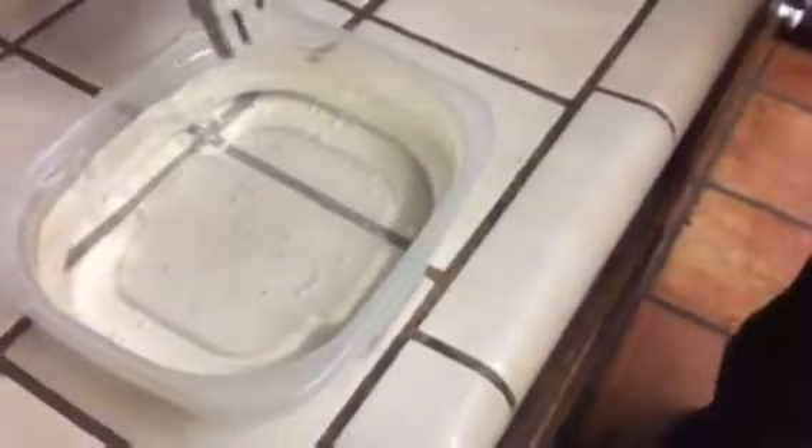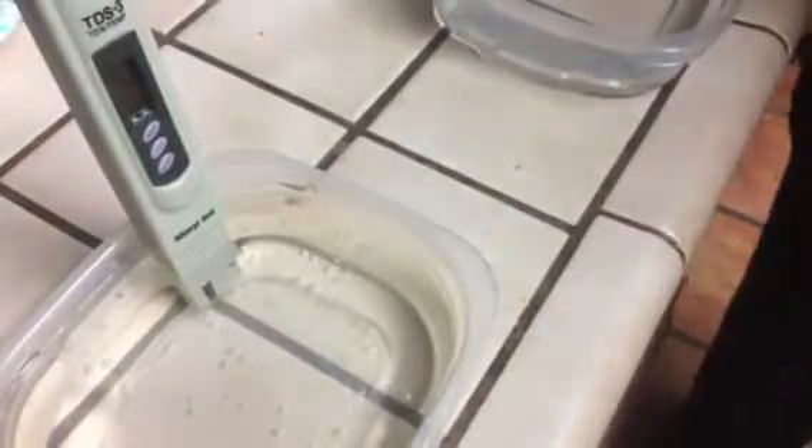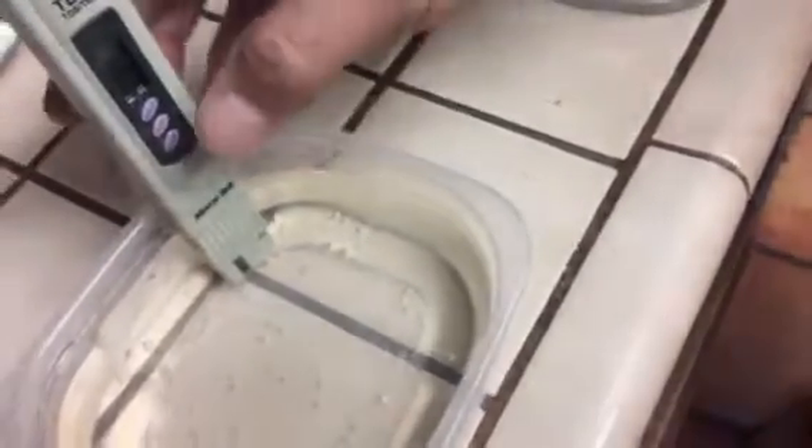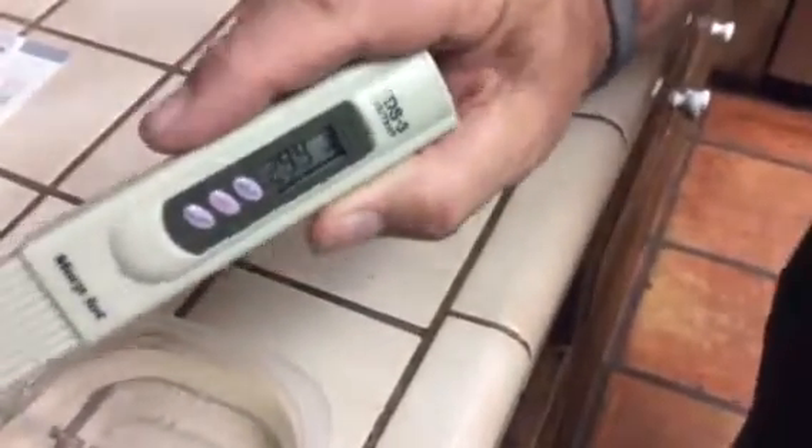And this is good old Southern California tap water. It's at 298. According to this chart, it says it's foul water. We have foul water in Vista, so don't drink this one.